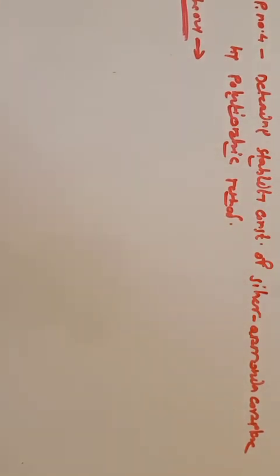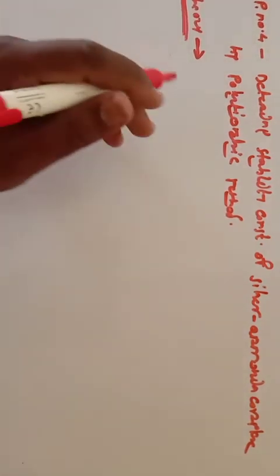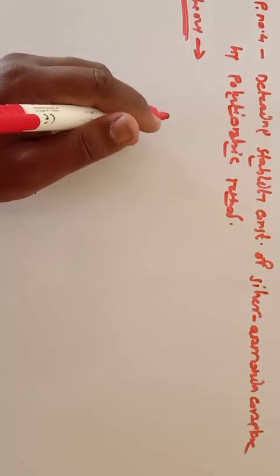Whatever solution is prepared after mixing of AgNO3 and ammonia, we get the silver ammonia complex solution. So on one side you take 0.001 normal AgNO3 solution, and in another beaker you take the silver ammonia complex solution, and then you connect the cells to the potentiometer and find out the EMF.